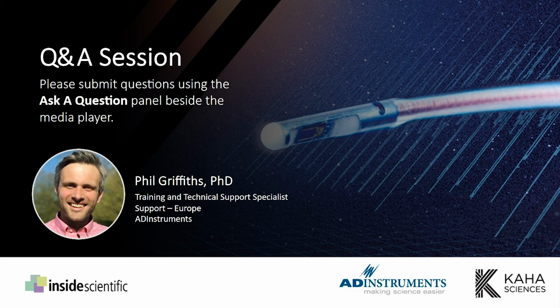So this question here is, can blood pressure and cerebrospinal fluid at the lumbar level be recorded simultaneously? Sorry, so they want to record blood pressure and cerebrospinal fluid, probably pressure as well, at the lumbar level.